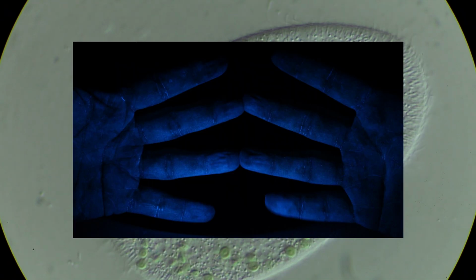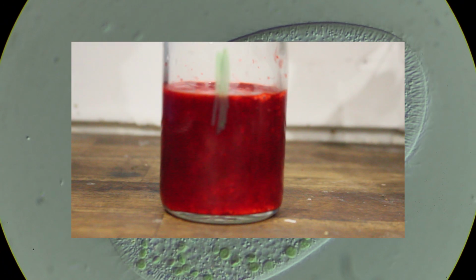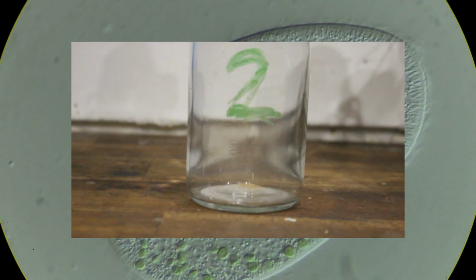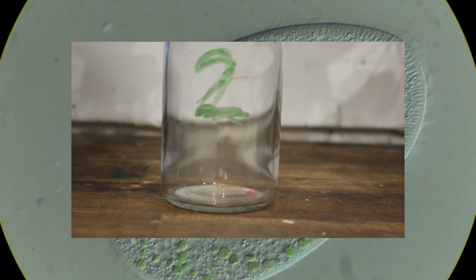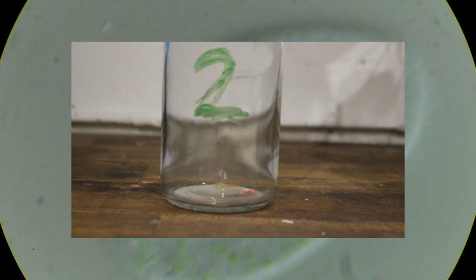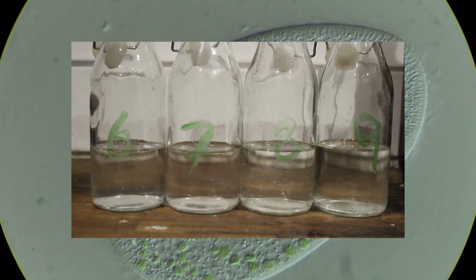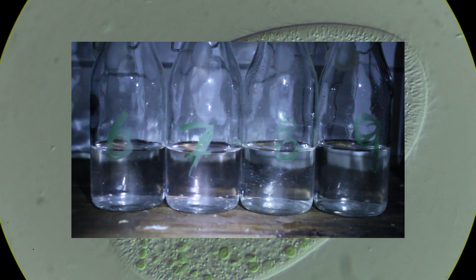In other cases, it might be useful to use a liquid version of this, sort of like a paint that flows into things like gaps and cracks. Then you wipe away or otherwise remove the material outside the gap. You repeat the previous application of light, but the fluorescence lets you see where the cracks that the fluorescent compound leaches into much more easily. In other cases, you can use what we've done in the past. It can act as a tracer or indicator of the presence of something, such as with our homeopathy dilution factor video.